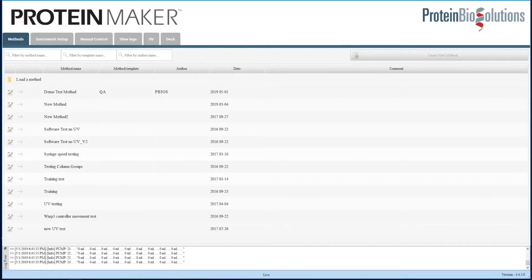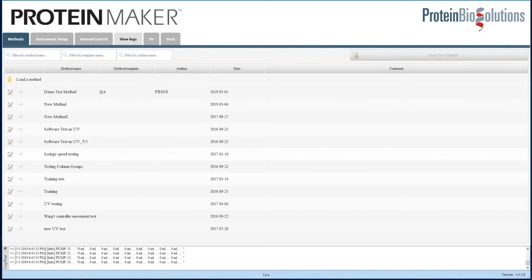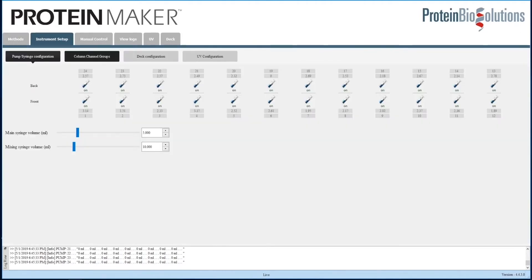This is the Protein Maker software, used to control the instrument. We aren't going to go through all of the details of the software, but I will show you a few simple components, and then run a demo method so that you can see how the software works.